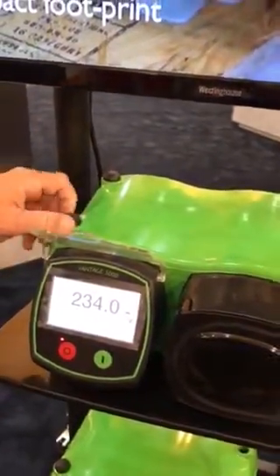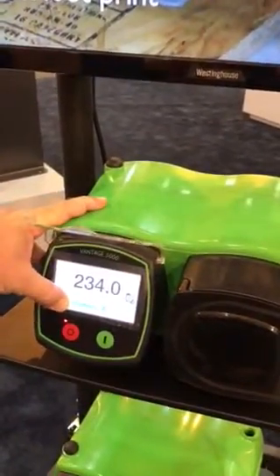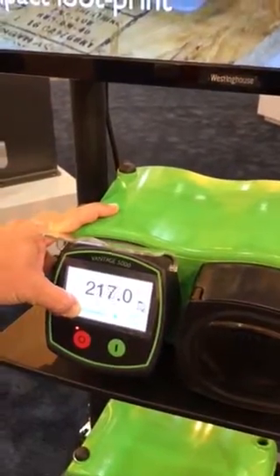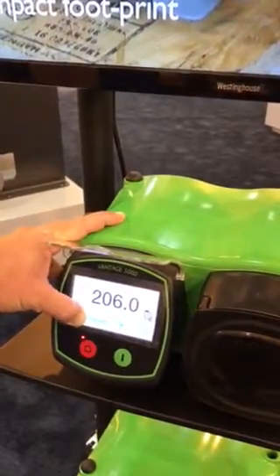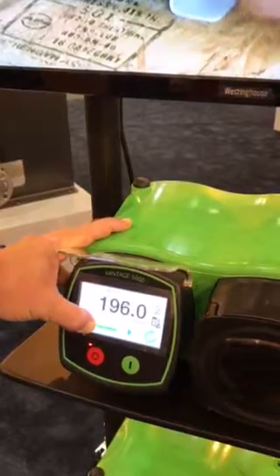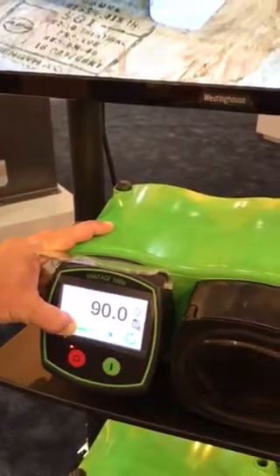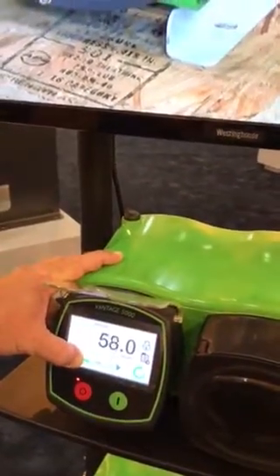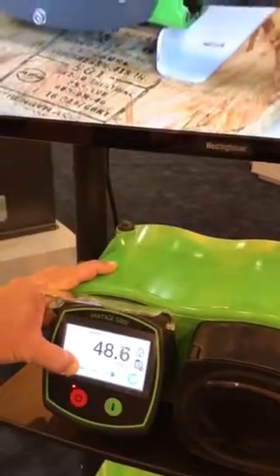Let's go back to the single digit milliliters per minute one more time, just to show that one more time. What's the maximum milliliters per minute on this pump? This pump will actually get up to 6,600 milliliters per minute. 6,600? Yes.